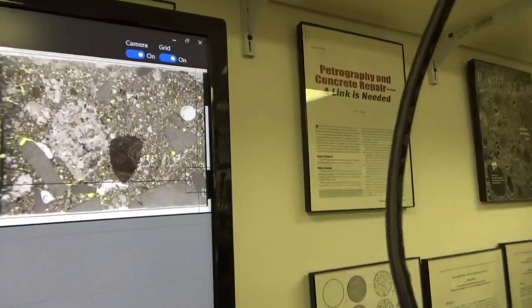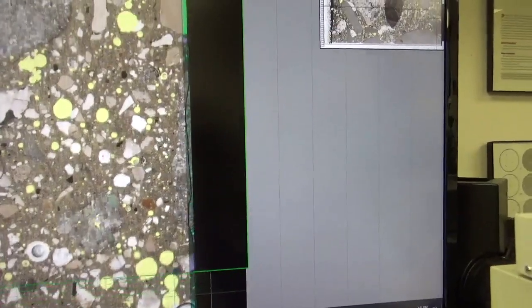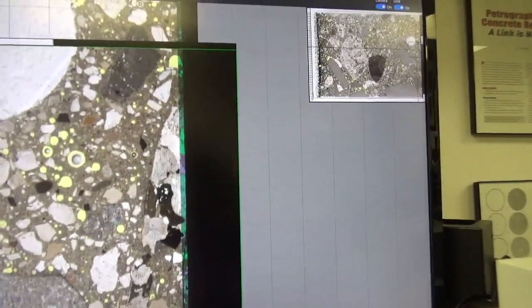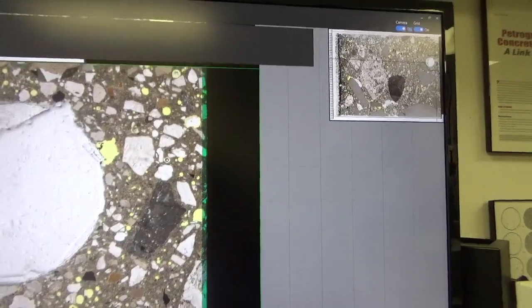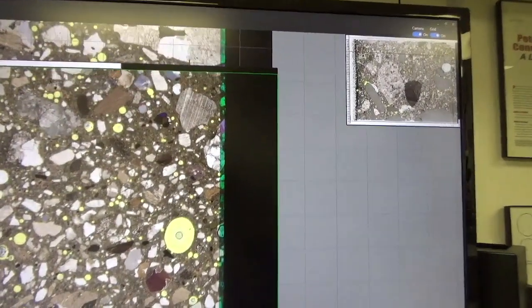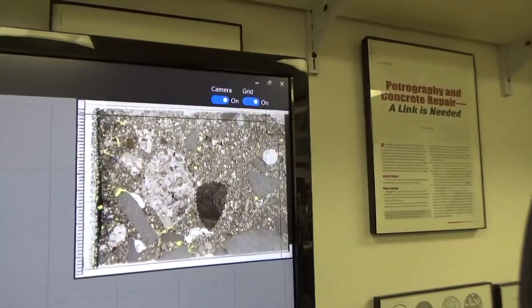And there at the end you can see the entire image has been scanned. I'm just making one vertical traverse to make sure that I have the end of the glass slide entirely. You can go back and forth if you need to make sure your entire area is covered. Okay, so that's pretty much the entire section.